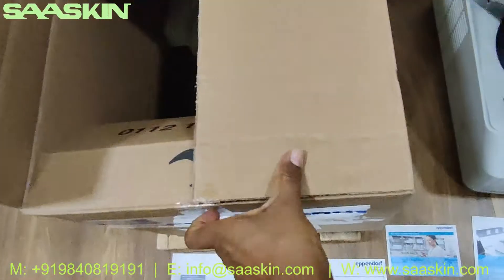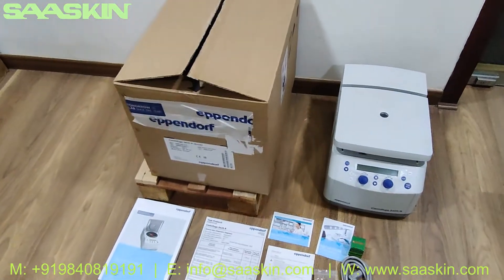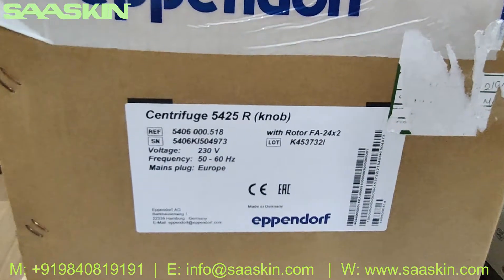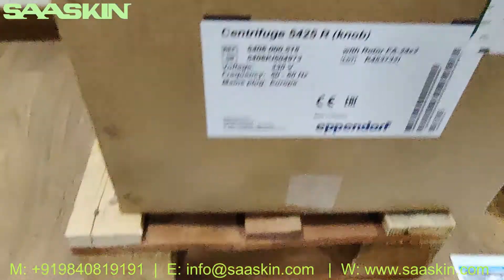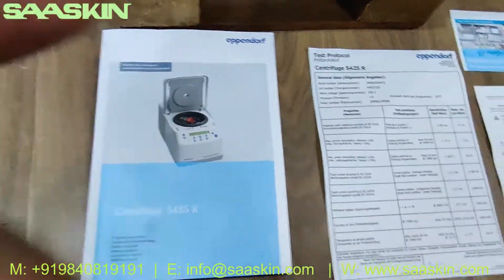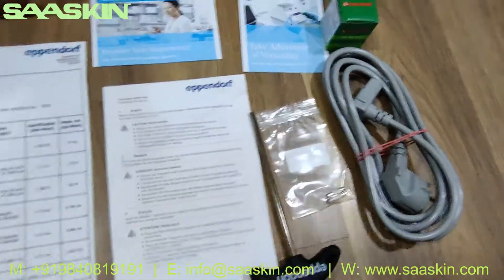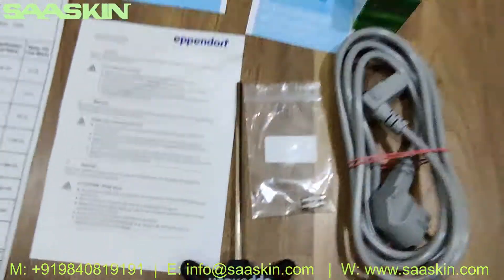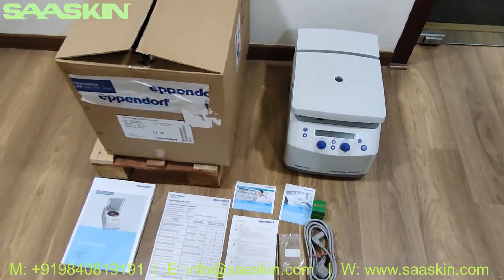Let me quickly summarize what comes along with the carton. The product we're seeing today is the Eppendorf centrifuge 5425R model. It comes with a booklet instruction manual, a product certificate, a quick safety protocol note, and a product registration guide. You also get a power cord, power plug, two fuse pieces, and the toolkit, along with the main machine.